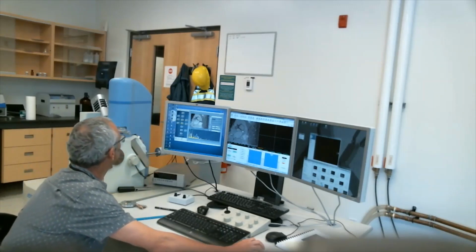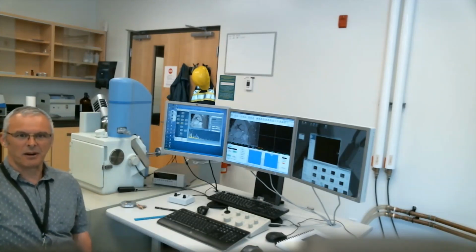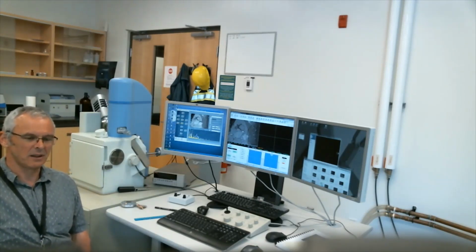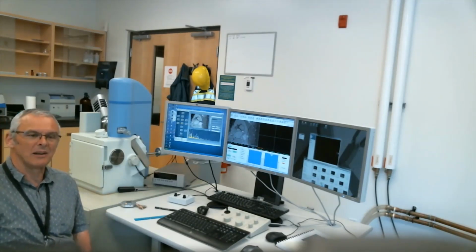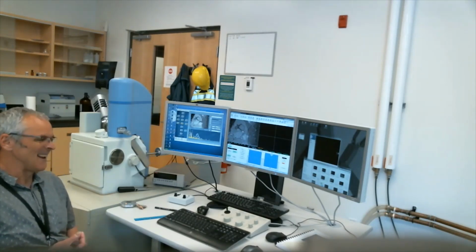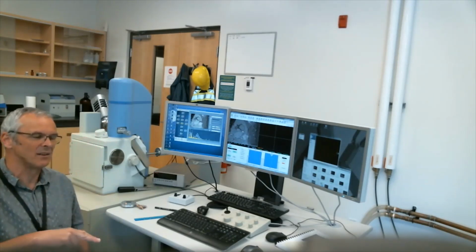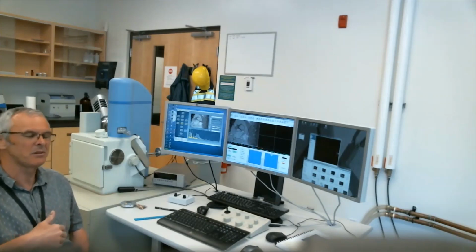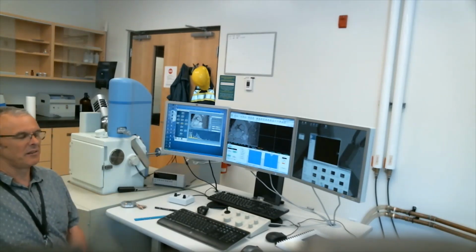And what I'm trying to find out is whether or not this silica peak in there is actually part of that mineral. Because I always get a silica peak. And because of the beam skirt, I can't really tell. I could be looking at X-rays coming from the crystals around it, or they could be in there. After a lot of work on this sample, I've started to realize that aluminum and silicon are always the same proportion, whereas phosphorus goes up and down. So it's making me think that the silicon is coming from the beam skirt. But if I had only done one analysis of that, I would have assumed it was a silicon-bearing phase. I would have been really mistaken in my identification.